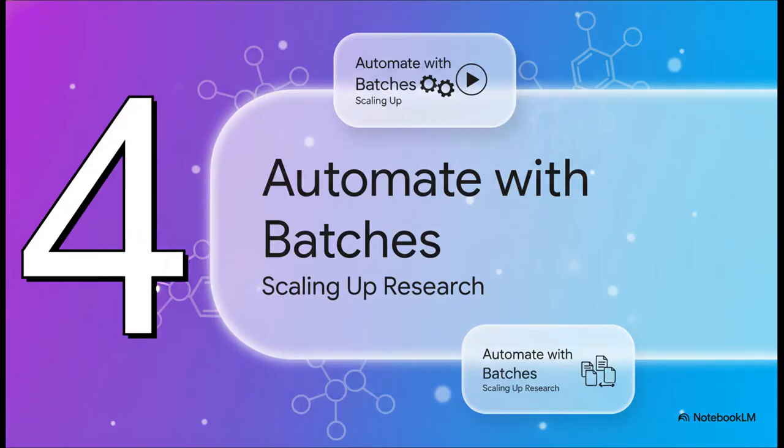So running one analysis is cool and all, but let's be real, modern proteomics is all about scale. What if you've got dozens or even hundreds of files to run? Well, that's where FragPipe's batch mode is about to become your new best friend.